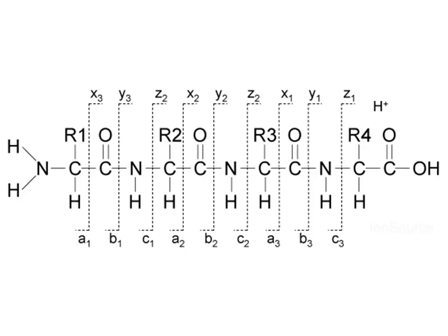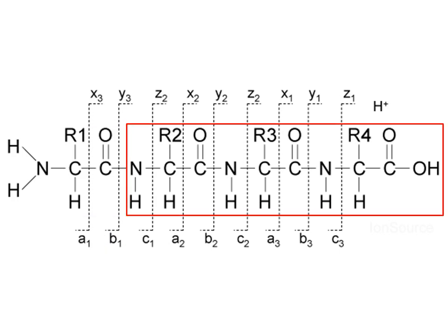When we discuss the fragments of a peptide generated by a mass spectrometer, we use a nomenclature to describe through which bond a peptide molecule is broken to generate a fragment. Peptides mainly break through the peptide bond, in this case joining the carboxyl group of the first or N-terminal amino acid in the chain to the amine of a second amino acid. When the molecule is broken through this bond, the N-terminal end is called the B ion, while the C-terminal end is called the Y ion.